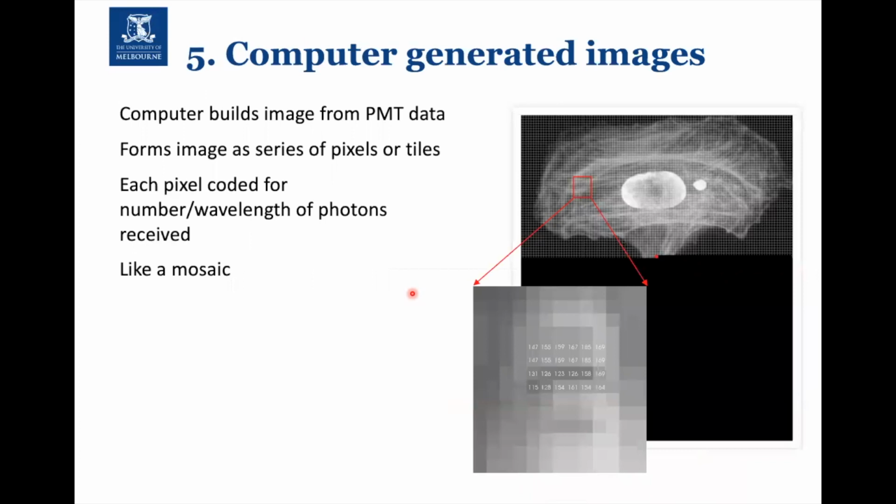The last thing, as I mentioned, is that we're scanning across our sample with the laser and binning the signal that comes back into individual pixels. I guess it probably applies the same to a camera: although we're generating an image, at the end of the day it's essentially an array of intensity values.